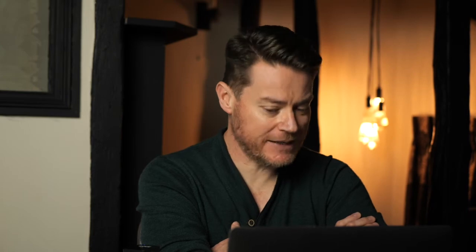The DSC trace is rather complicated. In the region of interest there is an endotherm followed by an exotherm, then a really noisy baseline, before it returns to normal. The question is: what is happening to the 2:1 form during that DSC experiment? You might say it starts by melting, but after that what is happening is really difficult to understand.